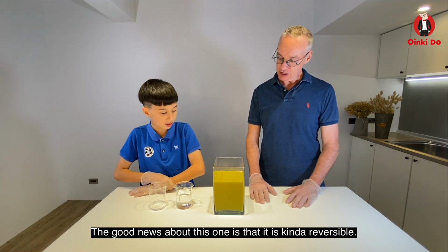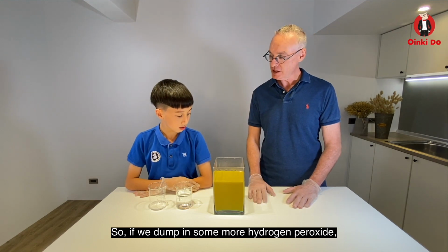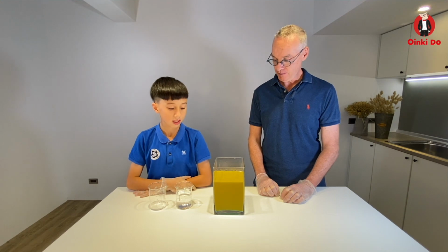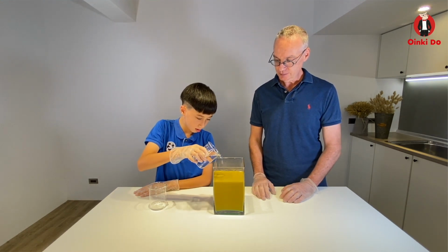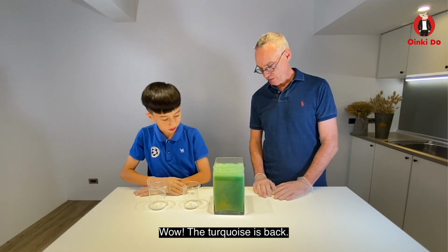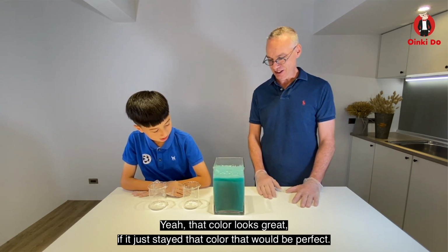The good news about this one is that it's kind of reversible. So if we dump in some more hydrogen peroxide, we can hopefully bring that nice turquoise color back. Give it a try? Okay. All right, looks fairly stable at this point. Let's dump that in. Oh, more turquoise bubbles. The color's back. Yeah, that color looks great. If it just stayed that color, that would be perfect.